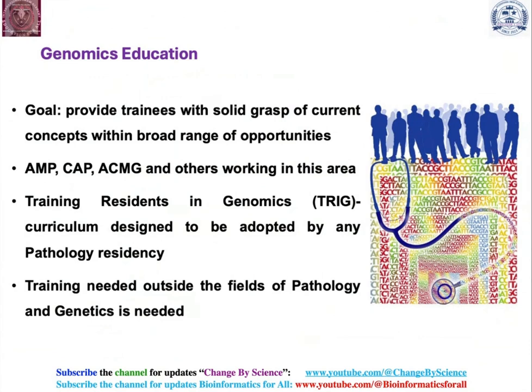Now I will be continuing with the details of the different types of NGS application and methodologies, and how to implement them easily without buying any commercial software.